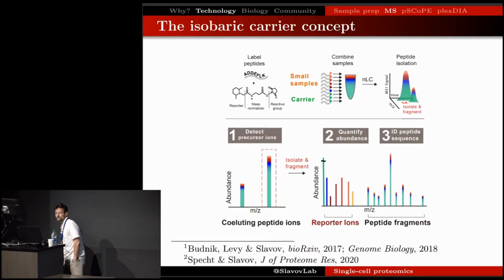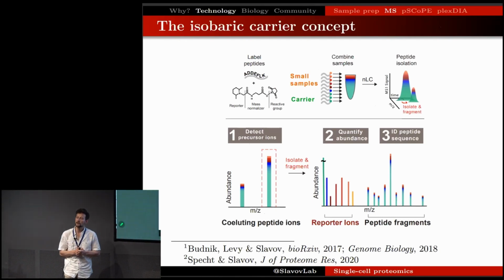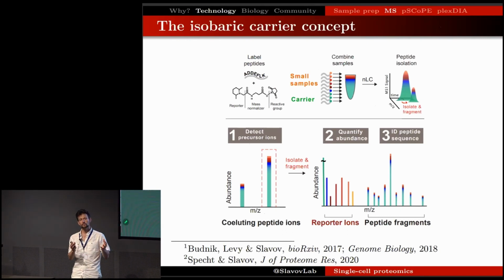And I'll share with you just one snippet. I don't have it on these slides, but one snippet of data that I found very encouraging in those early days is that we could measure fluorescent proteins in single cells on a FACS sorter. And then we could also measure these same fluorescent proteins with mass spectrometry, and we found that the two measurements correlate strongly. And this evidence was quite convincing because we had two orthogonal measurements concurring on the same result.